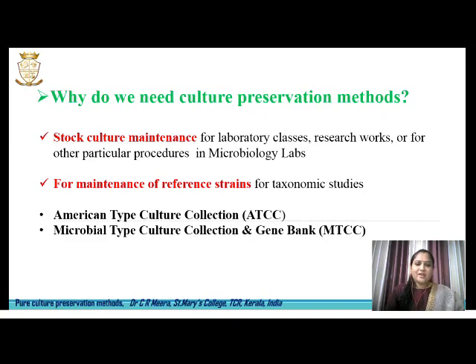First, let us see why we need culture preservation methods. In a microbiology lab, as we all know, we are constantly in need of pure cultures of different microorganisms for different laboratory sessions, research work, and for other particular procedures. We usually call them the stock culture. Pure cultures of all microorganisms also have to be retained as reference strains for future taxonomic studies.